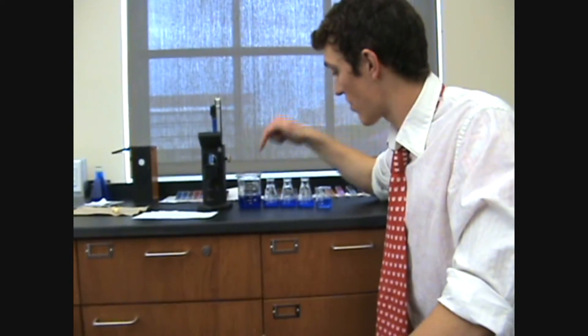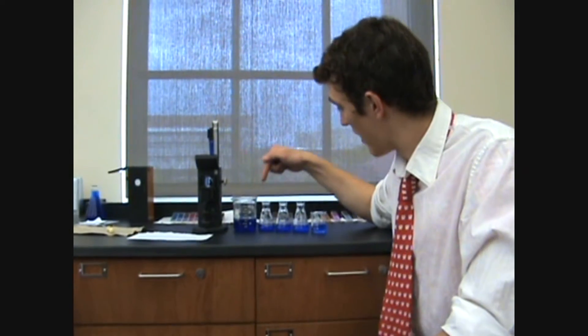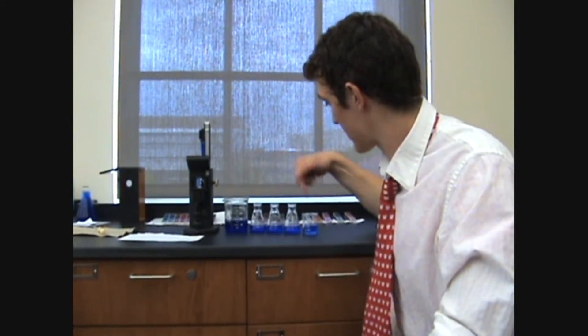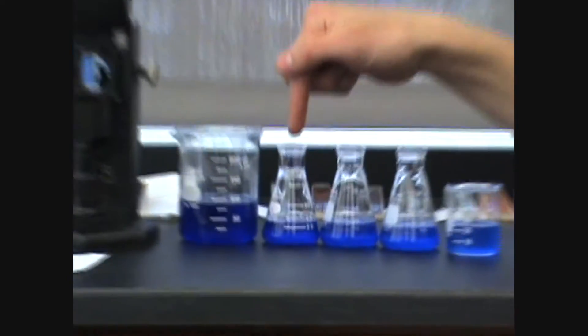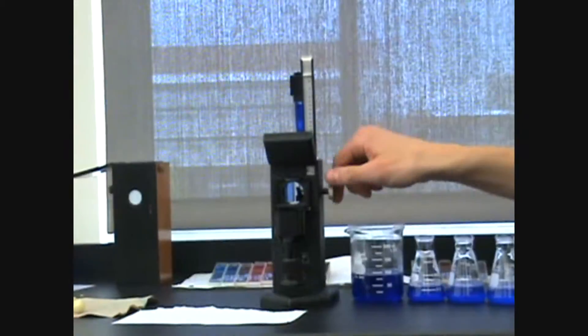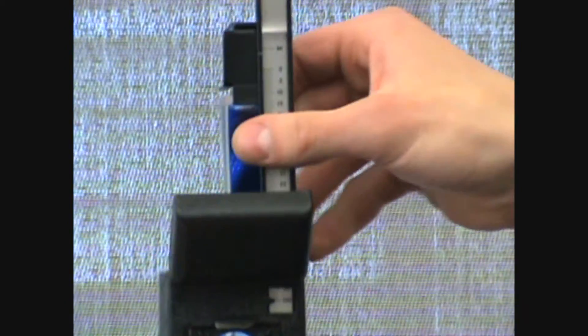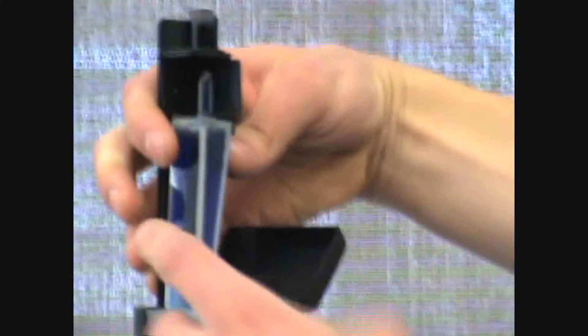I have this concentrated dye right here. And then, I have diluted each one by 20%. So, I'll consider this one 100% concentrated dye, and this one 80%, 60, 40, 20. So, what I did was I compared this to our blue standard, which I have already put into the Helige wedge apparatus. So, that's right here.